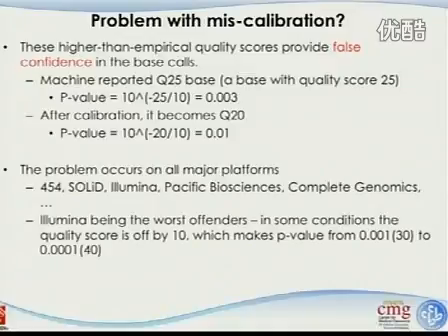Yes? I have a question about the p-value. So does it mean that if the p-value is 0.01 and you are sequencing 200 nucleotides, that means your expectation of error is 2? Yes. That's exactly what that means. P-value is by random. If you sequence 200 nucleotides, there are 2 sequencing errors.